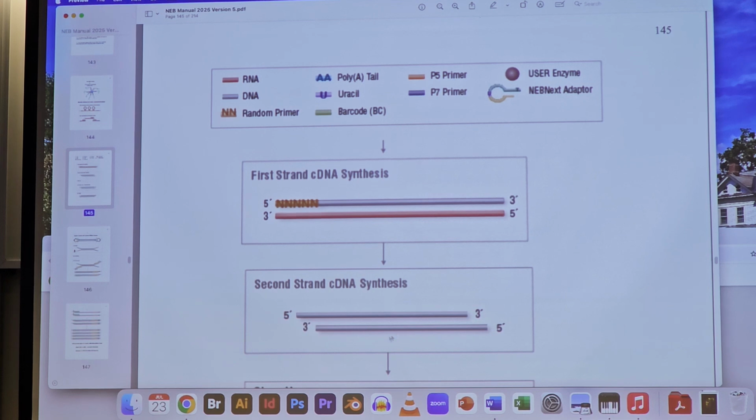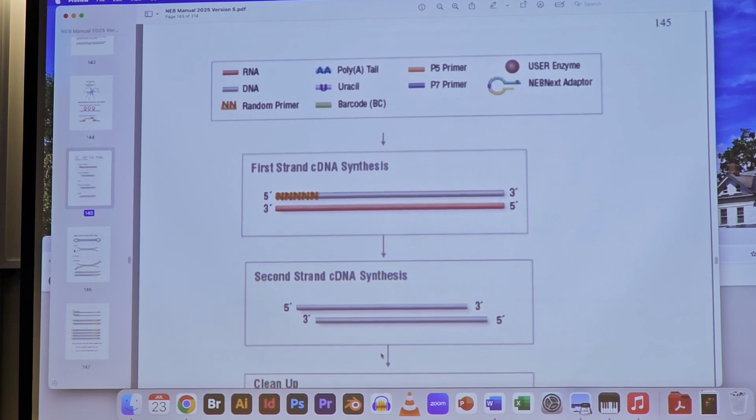They're not showing a 3' overhang, which is a little annoying because 3' overhang is the one that we always get, and I showed that on the board there. So I would say that the way that I draw things on the board is more detailed. These things are a little bit more like sketches of what's going on.